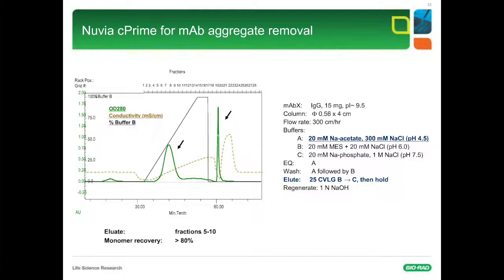They may change the interaction between the target molecule, impurity molecules, and the chromatography media, through changing the electrostatic interaction, hydrophobic interaction, or the strength of the hydrogen bonding. We cannot really predict, and we have to do experiments. In the next case, I will show you how we do that.